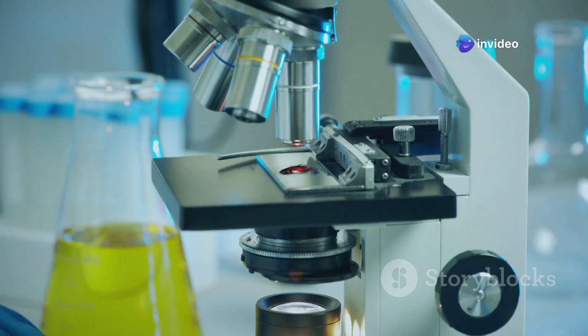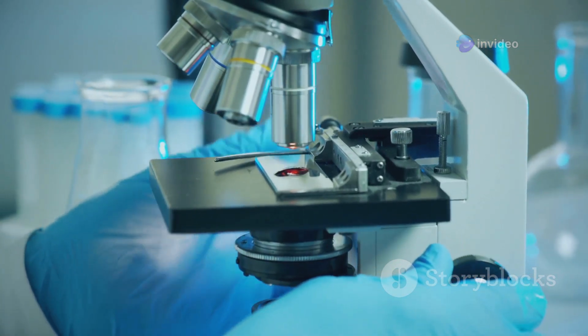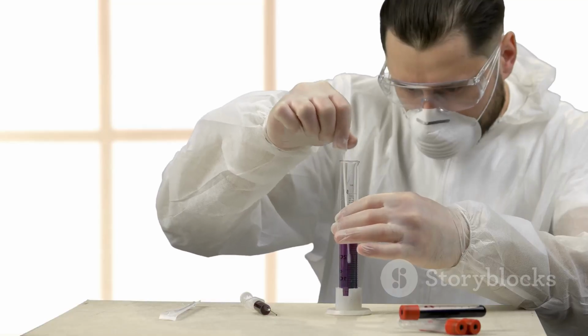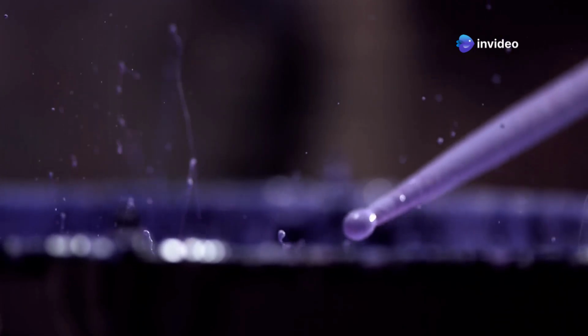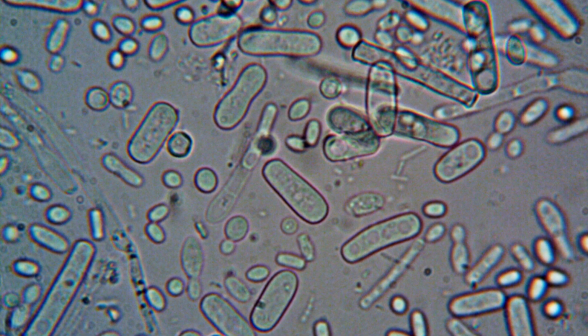With our bacterial smear prepped and ready, it's time for the main event, the staining process. Now this is where things get really exciting. First, we flood our slide with crystal violet, our purple dye. We let it sit for a bit, giving the dye plenty of time to soak into all the bacteria. It's like giving our bacteria a nice, relaxing bath in purple dye.